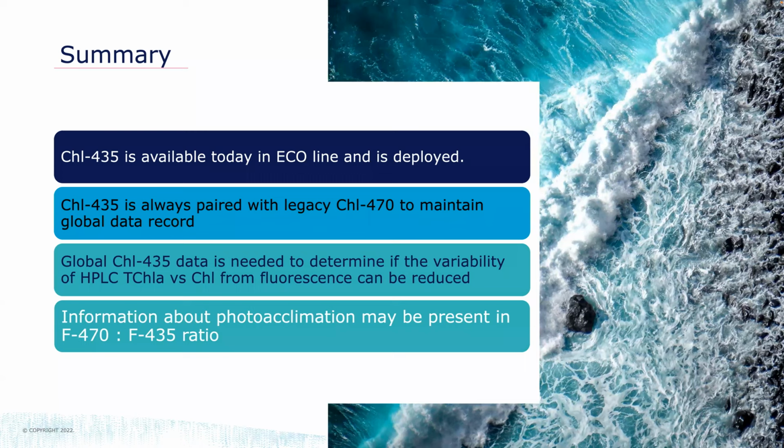If you're really careful in your technique and essentially if you can make sure that your protocol, and I know that there's a couple different tweaks to the fluorometric approach, but as long as you're consistent, that's the most important thing. Yes, you can do that.